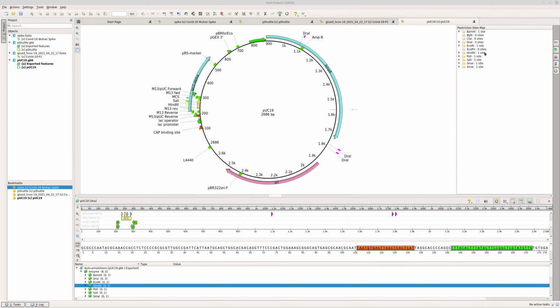well as we have these restriction sites activated, or restriction enzymes activated, and you can see where they are located here. Typically, we're going to use something that's in the multiple cloning site to establish our capacity to insert our pieces of DNA into this space, right, for our control, because the multiple cloning site should represent unique restriction sites within this. Hence, if we look at DraI, we can see there are 3 sites, and notice that they are not in the multiple cloning site, so therefore they're not useful.